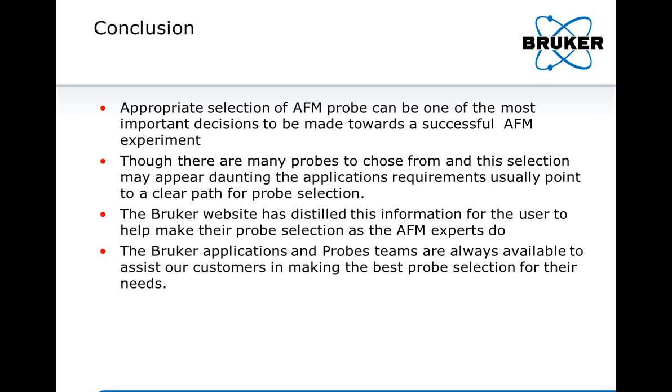Okay. Let's see here. So now moving more into the specific questions of what probe is right for the job here. I've just started using MLCT probes with PeakForce QNM, and I'm having trouble getting a nice stable heartbeat. What's the best approach for using soft cantilevers with PeakForce Tapping?